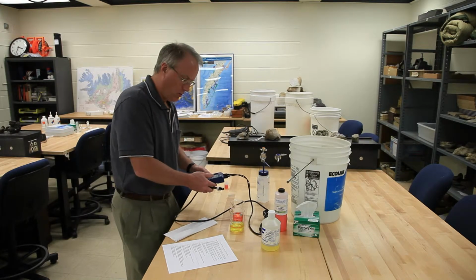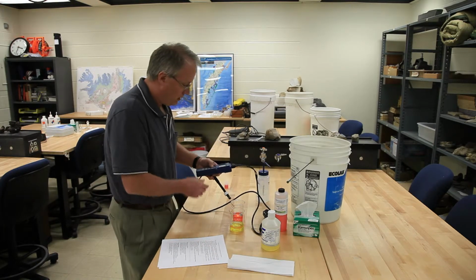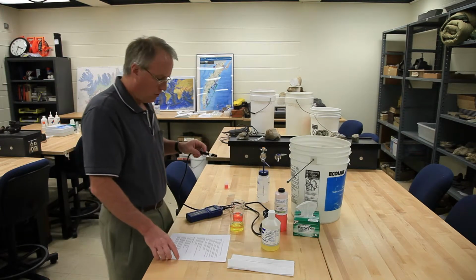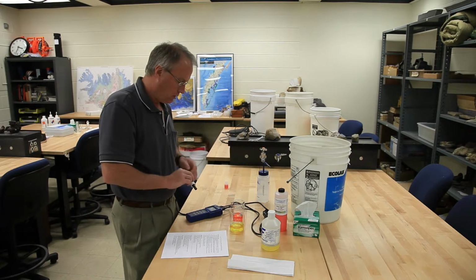So I'm going to follow the instructions for first the quality control check of the pH meter. And I'm not going to go through every step of the instructions here because you really need to read them as you're doing the work. But let me give you the big picture so you see what's going on.